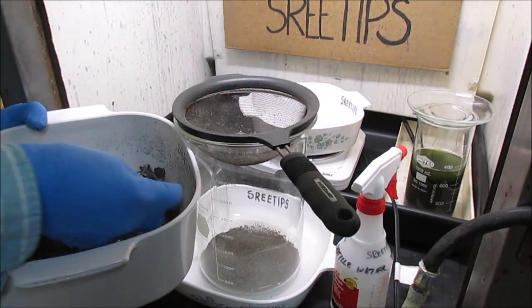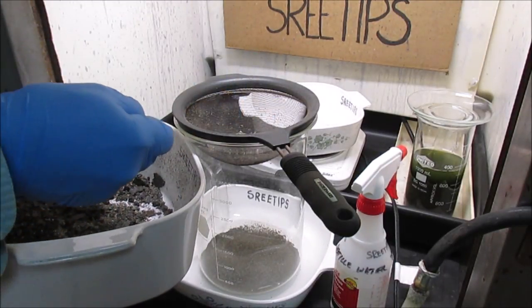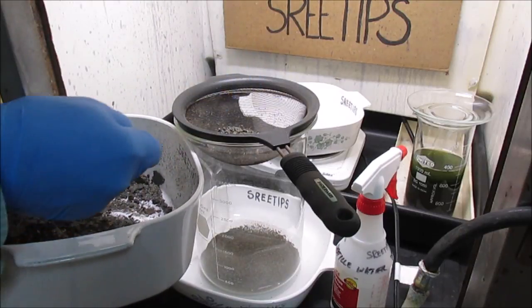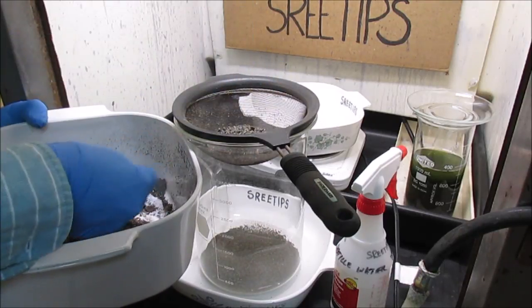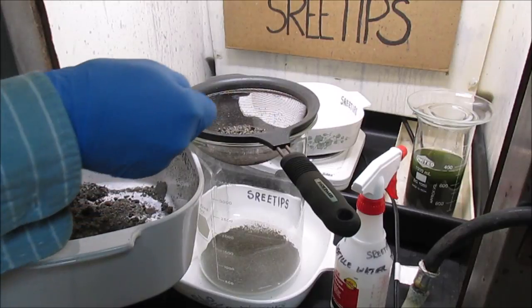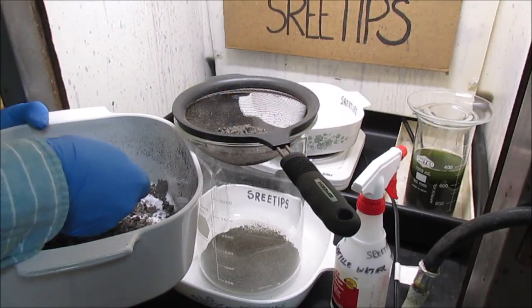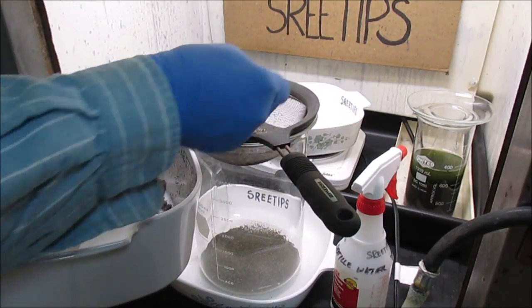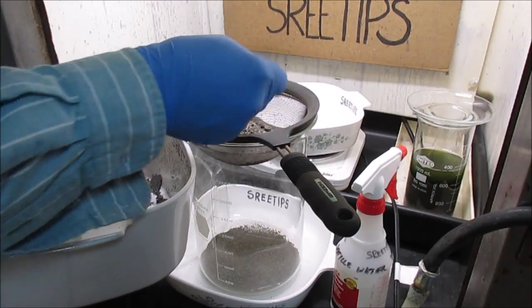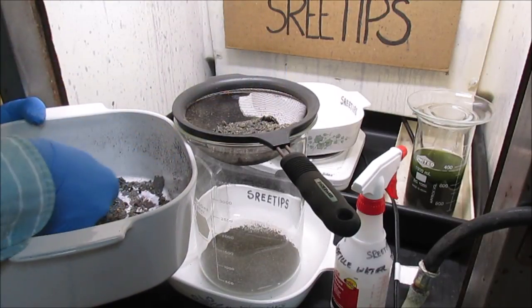But this strainer will strain out any large pieces of chunks of aluminum that may have gotten in with the ash, so it doesn't get down into the beaker. Aluminum will cause problems when we go to try to get this metal out of this ash.